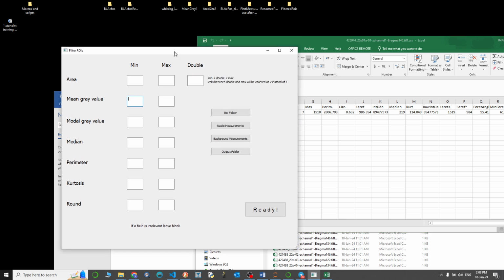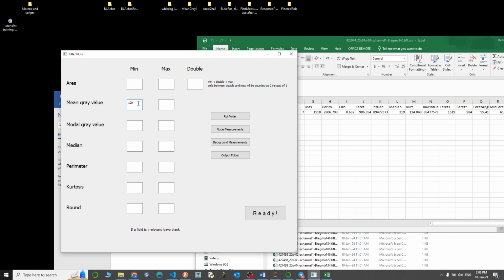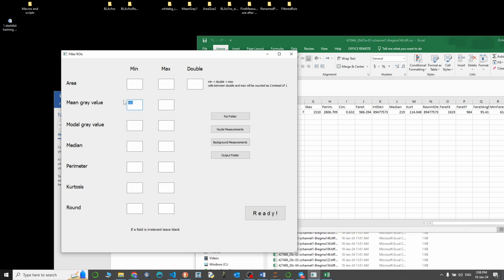So this gives us the leeway to act a bit more dynamically and say that if I add, for example, 100 here, then it sets as the minimum accepted gray value of an object that has been predicted by my StarDist network this value plus this value. And the only stable thing here is the value that you have submitted, right?